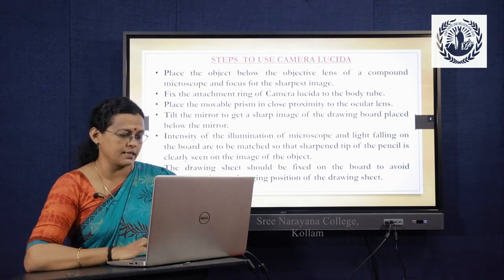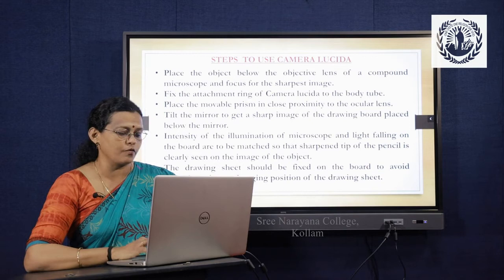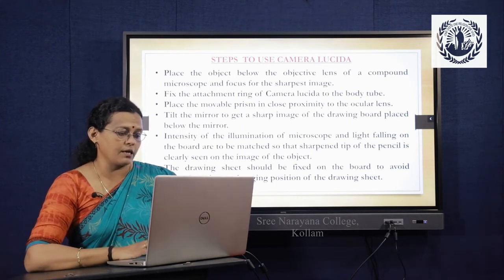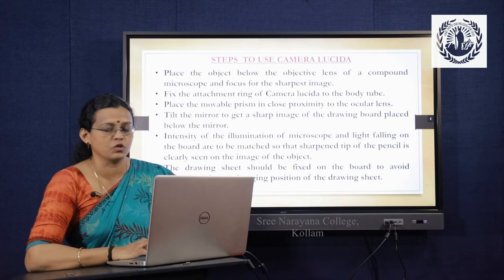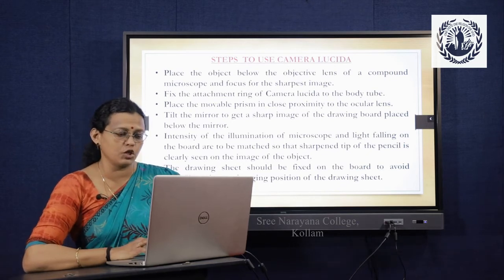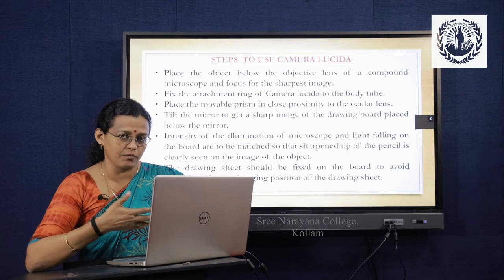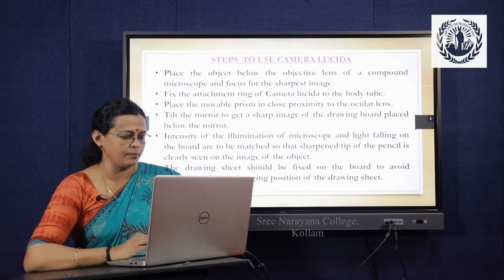Once you tilt it like that, you get the image of the drawing board onto the microscope through the ocular lens. The intensity of the illumination of the microscope and the light falling on the board are to be matched, so that the sharpened tip of the pencil is clearly seen on the image of the object. This is something which has to be taken care of. The illumination of both the microscope and the light falling on the drawing should coincide, so that both of them are visible at the same time for drawing very clearly.